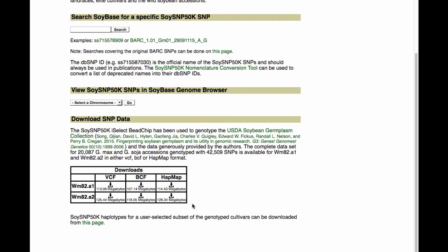The table offers results in either Williams82 assembly one coordinates or Williams82 assembly two coordinates. You are given your choice of three different formats for the file: either as a VCF file, a BCF file, or a HapMap file.